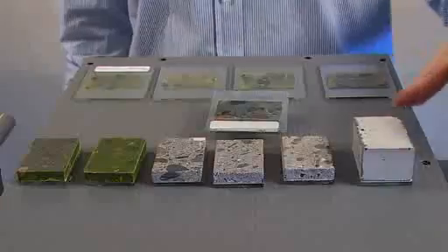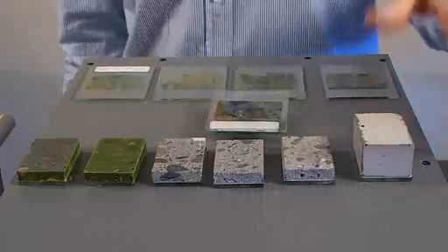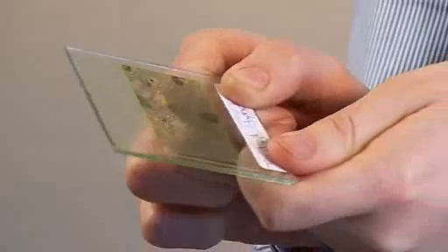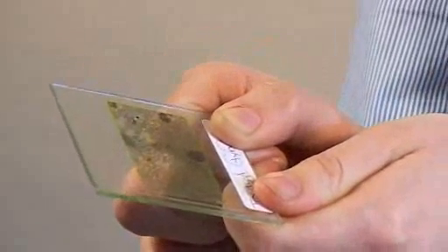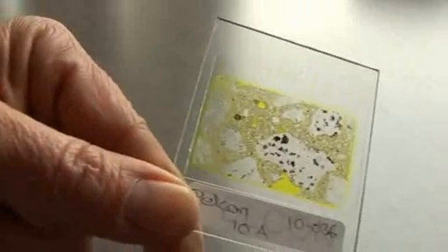The production of thin sections on the Pelkan Automatic Thin Section Machine is a sequential process. You start out with a block of concrete, natural rock, or whatever your starting material is, and go through a series of grinding steps to end up with a finished thin section — all without any manual processing of the product. This ensures that we can produce thin sections of very high quality, with a thickness within microns of the desired thickness, and each specimen is equal to the previous one.